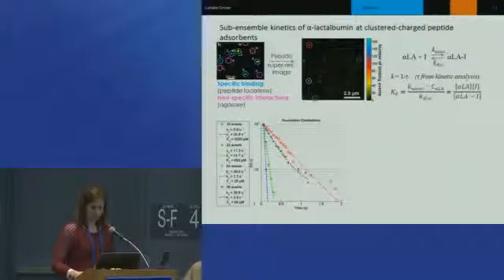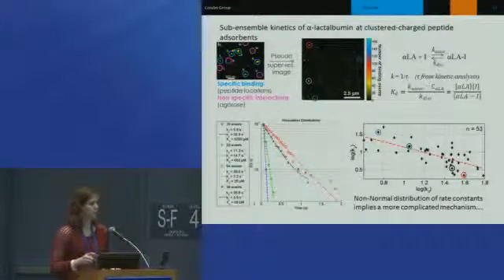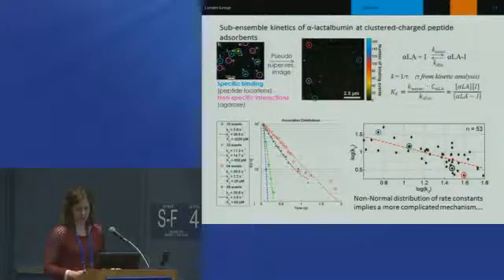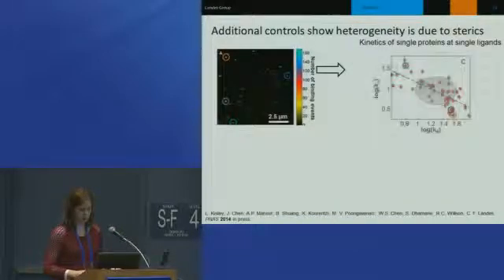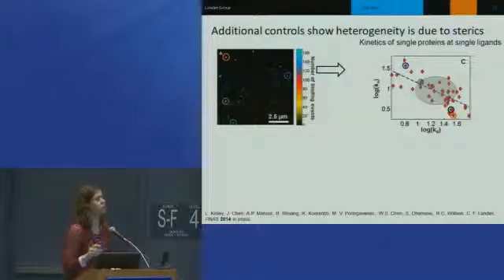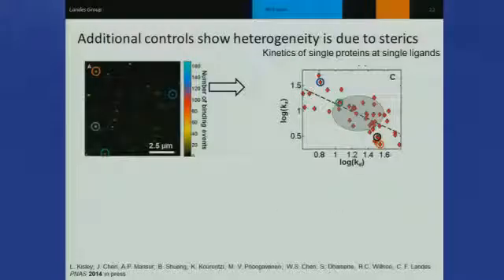But then we also, with the distribution of kinetics, we can see that things are actually a little bit more complicated than what the theory predicts, and I'll show that more on the next slide so you can see it more clearly. If there were purely just a thermal distribution of the adsorption and desorption kinetics as described by that theory, all you would see here is a 2D Gaussian broadened by just the uncertainty in our ability to extract the rate constants. But instead, there's this complicated log-log inverse relationship between the adsorption and the desorption rate constants, which imply there's something more complicated going on here.